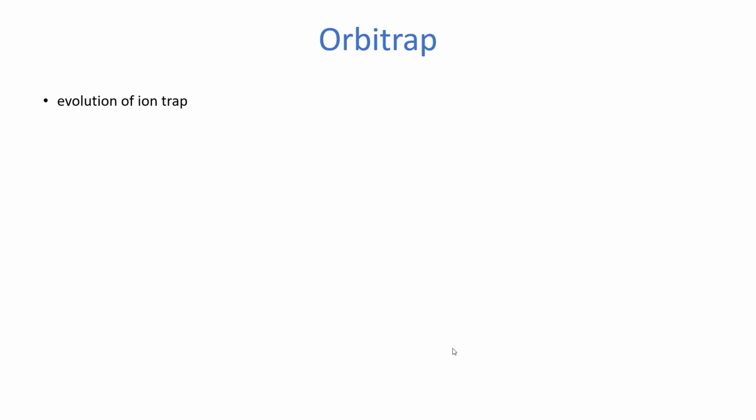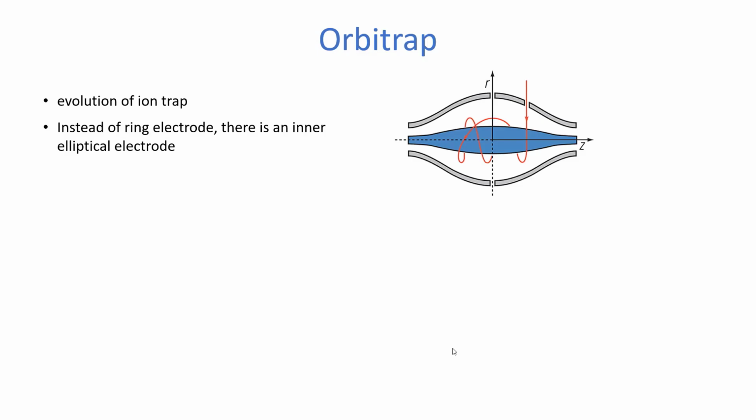I was really lucky when I was at Trent to work with a man named Ray Marsh, by the way, who is one of the grandfathers of mass spectrometry, and he patented and invented the original ion trap mass spectrometer. And so now the Orbitrap is an evolution of that.